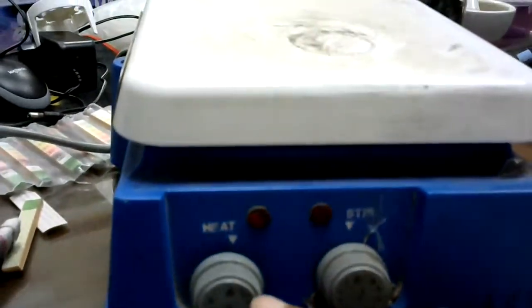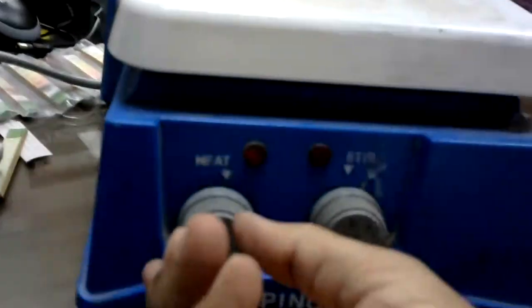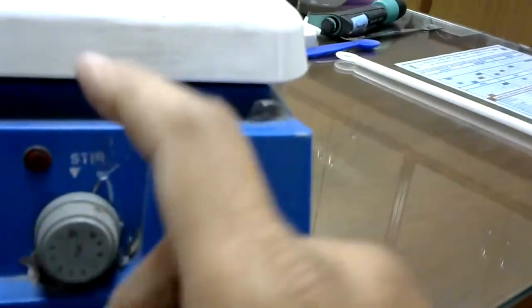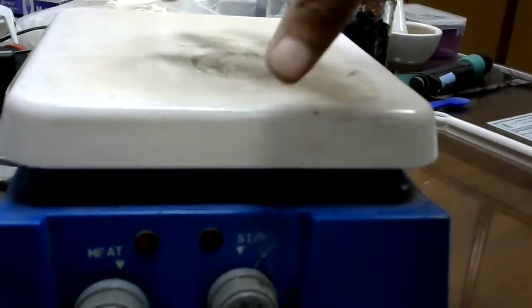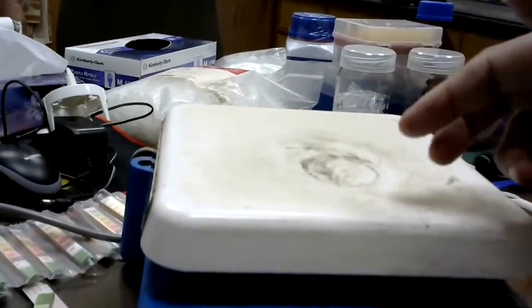So this is a hot plate. This is a hot plate, and again you can see that this is stirring. So a knob is there. This is for heating. You increase the knob, it will increase the temperature, and here you can see stir. So this will do the stirring. You can put your bottle here and switch it on.